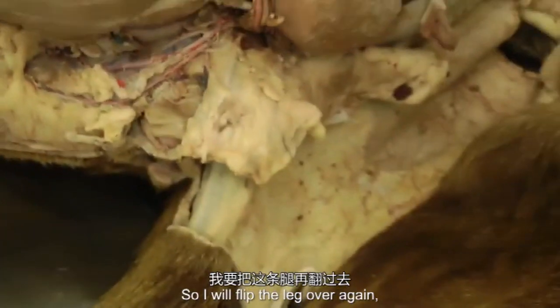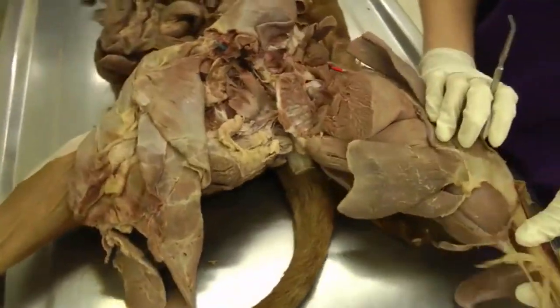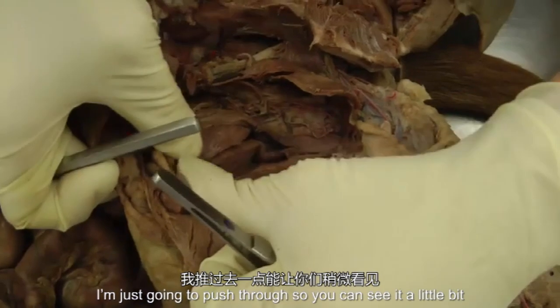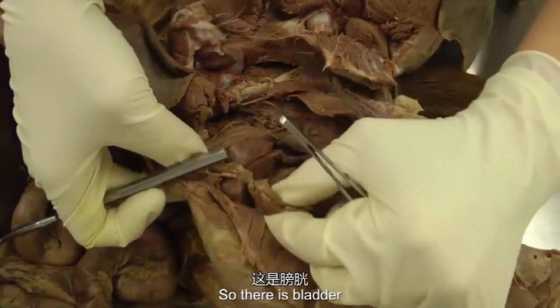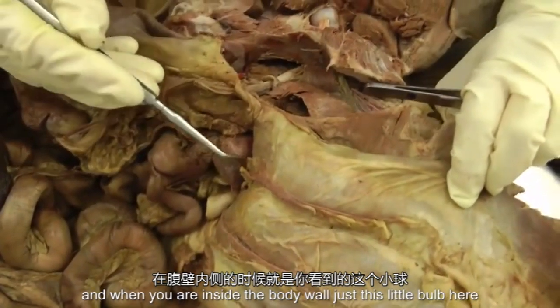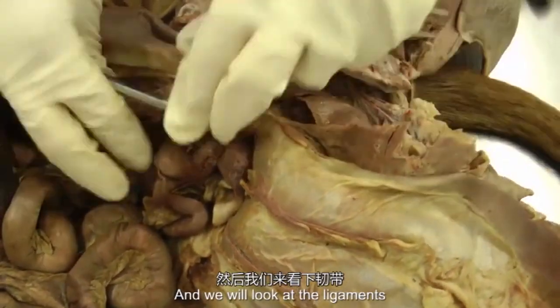So I will flip the leg over again, and here we'll go back to where we saw the bladder. I'm just going to push it through so we can see it a little bit. So there's the bladder, and when you're inside the body wall, it's just this little bubble here. And we'll look at the ligaments.